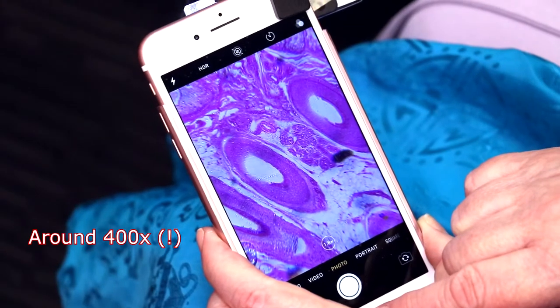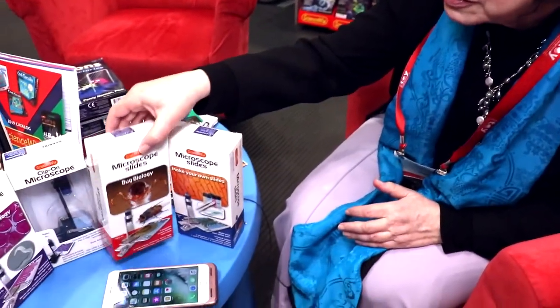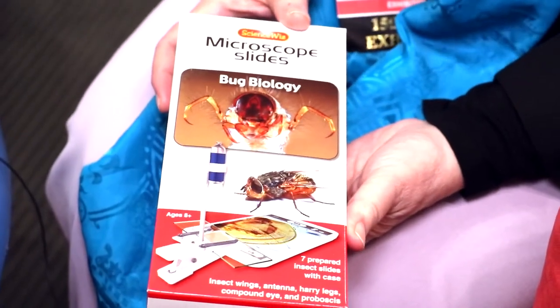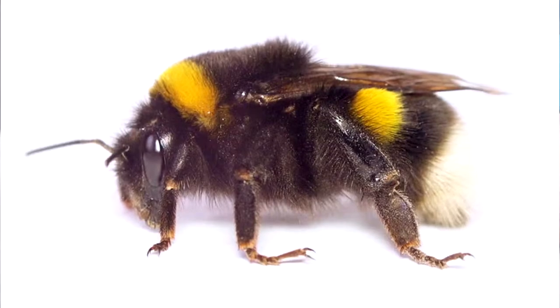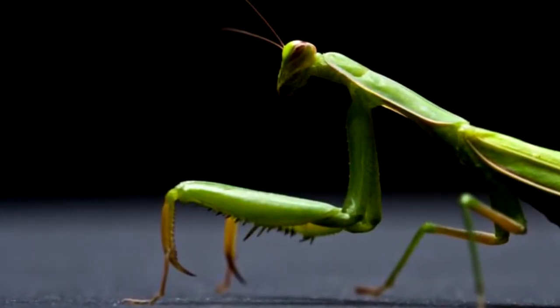What you have here is a true microscope that you can use to see cells and look at slides. It's wonderful to view insects because you can see the details of their antenna, mouth parts, wing structure, and compound eyes in ways that lower magnifications just can't show. We have a set on bugs, and what astonished me is just how varied the insect legs and wings were. The honeybee has very hairy legs, which makes sense because they collect pollen with them. And the praying mantis essentially has swords — they actually spear their prey with them.